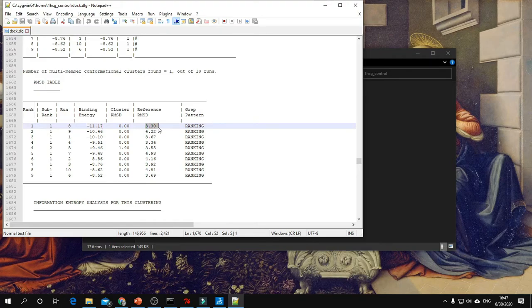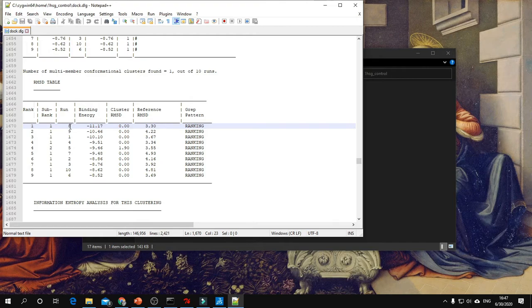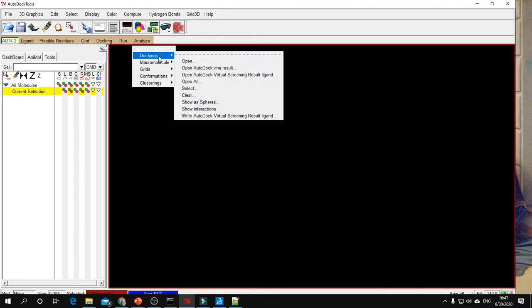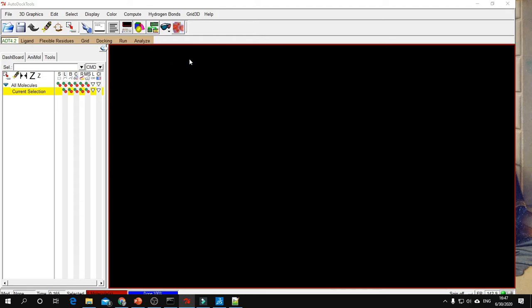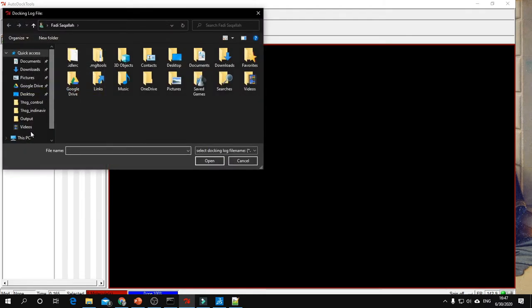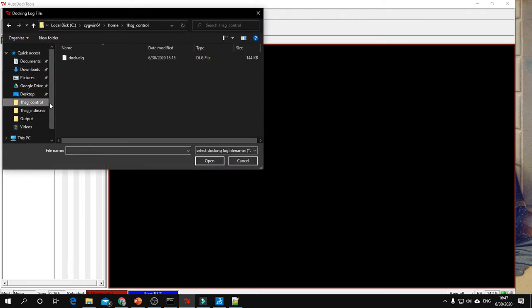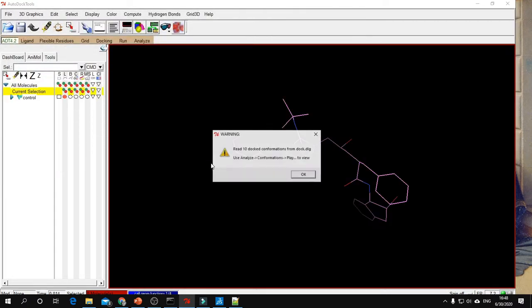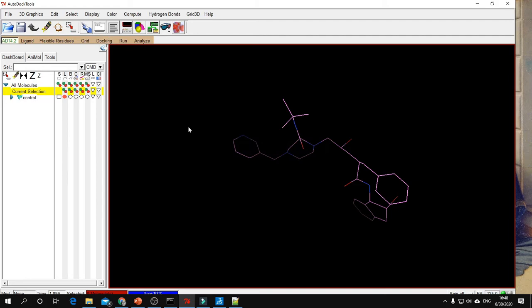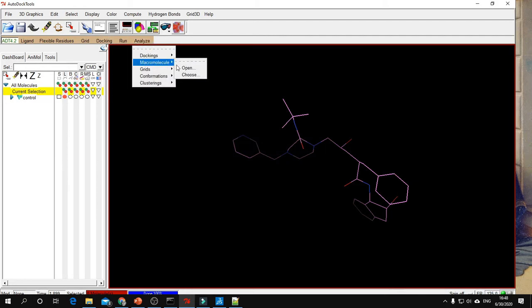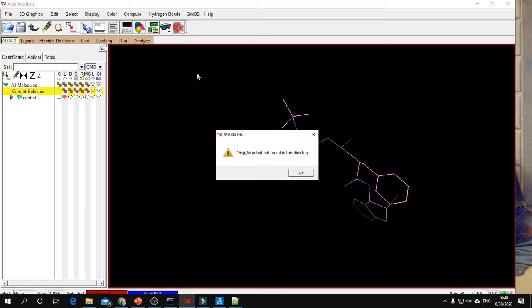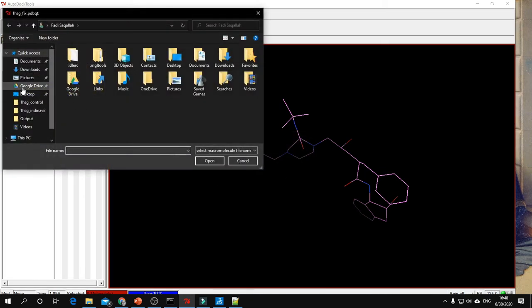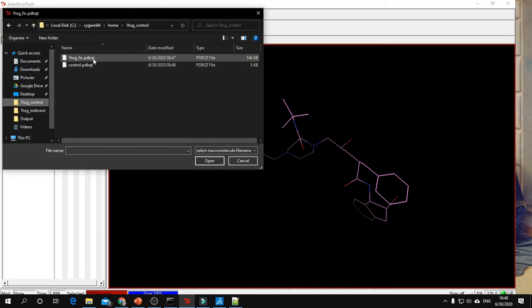After this, to visualize conformation number 8, open AutoDock Tools. Go to Analyze, Dockings, Open, then select the folder and open the DLG file. Then add the protein by going to Analyze, Macromolecule, Open, and select the PDBQT file of the protein.